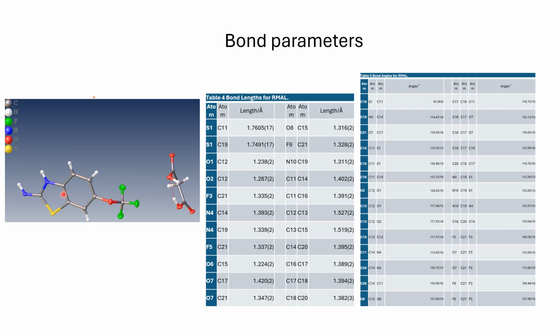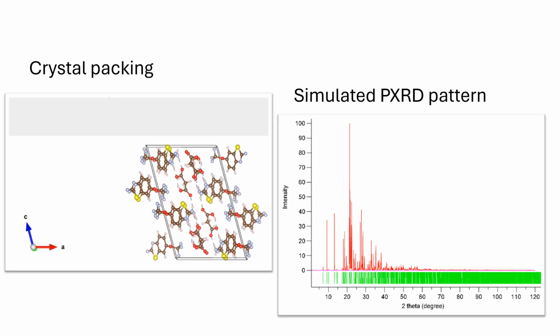and then next to it there is a ring having NH, sulfur connected over here and an NH2 substitution, right? And this electron density is actually C double bond O, CH2 C double bond. This is a molecule which is having hydrogen bonding itself, right? And these are the bond lengths shown over here. This is the corresponding crystal packing diagram, how motifs are arranged in the cell, and this is the corresponding PXRD diagram.